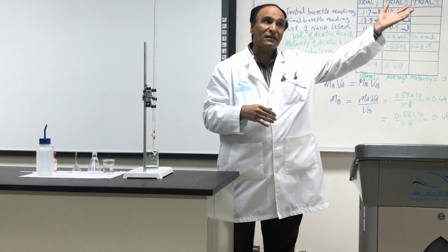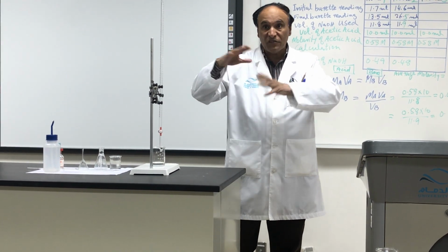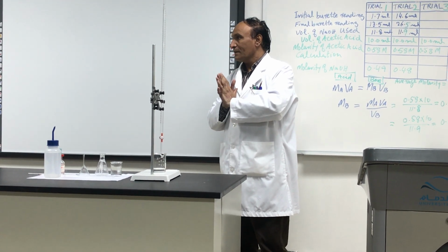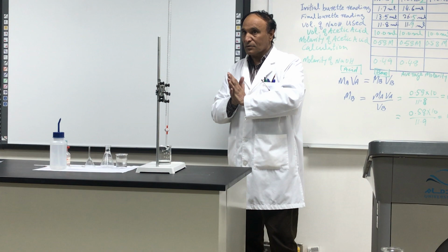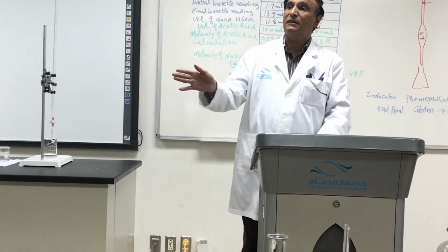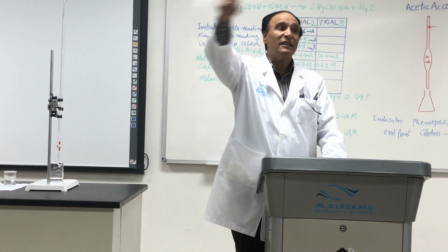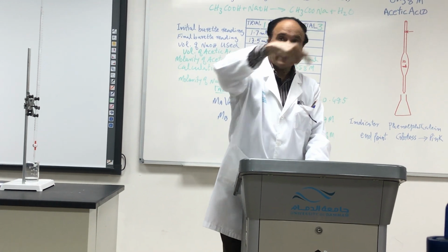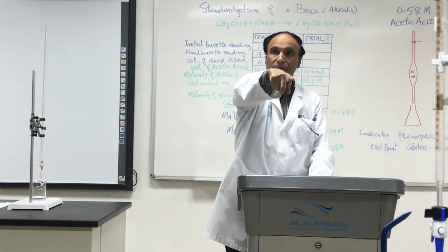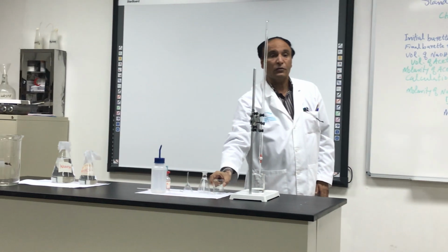When you go to some other lab, you will do more experiments, a little more difficult than this one. So I hope you understand what I did. Okay, boys? Next time when you come, I will tell you the page number, you will remove the page and show your work over there. On that side, in two places, there will be acetic acid. One student will take the acetic acid, the other student will fill the burette. One of you will come to me and bring the beaker, not both of you.